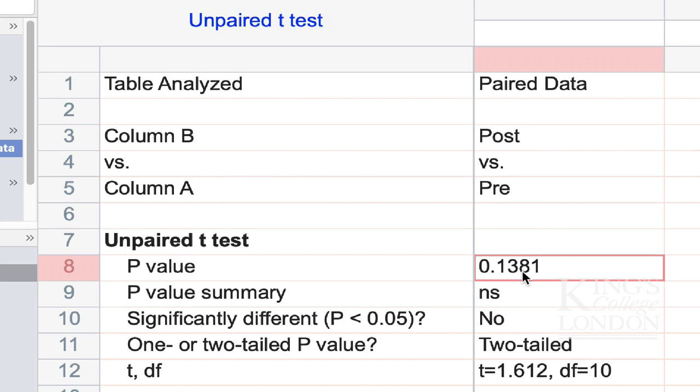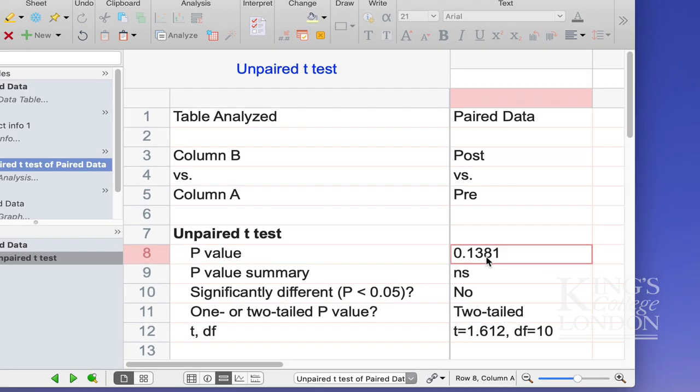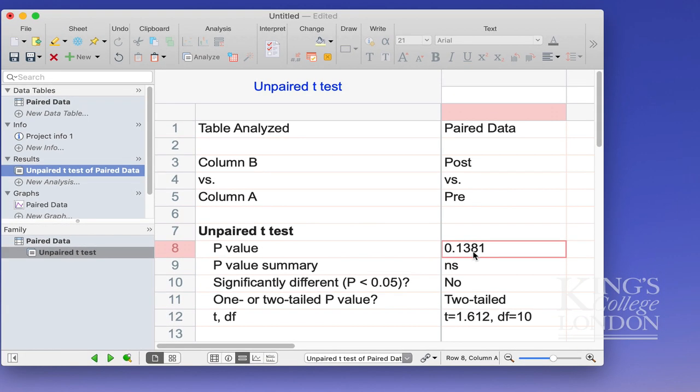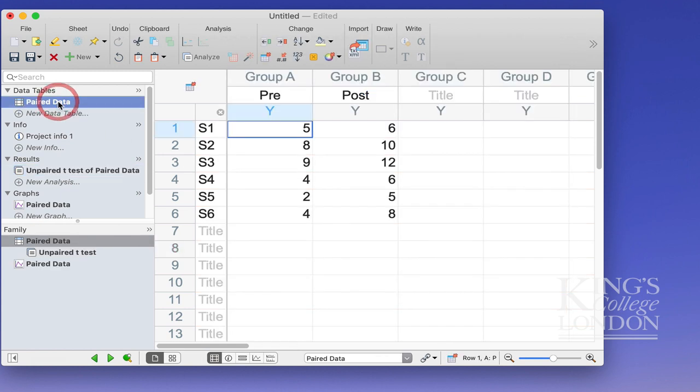The data are paired, but we've undertaken an incorrect test, an unpaired t-test. So let's go back to our paired data and let's carry out a paired t-test.